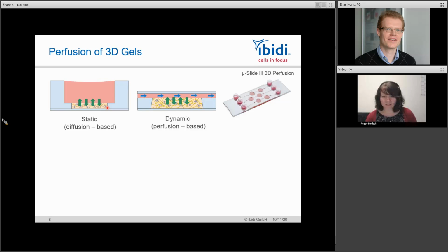And we have Kilian, who is using the microplate angiogenesis. And he has some trouble with high adherence of the cells at the bottom while doing 3D, I guess. So do we have any recommendations?